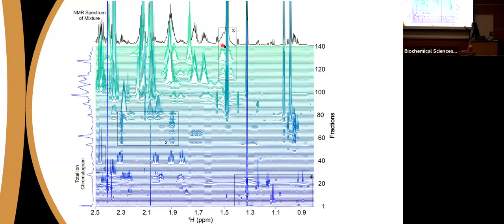Point 3 is actually something that I find really intriguing up here. If I looked at that peak in a 1D spectrum, I'd say, oh, the shimming's bad, or the phase is off, or something. I'd complain to my student, I'd look at that and say, yeah, it's kind of weird. But what you see instead is that you have this pattern of overlap that accounts for all of that weird looking peak shape that you see in the 1D spectrum.